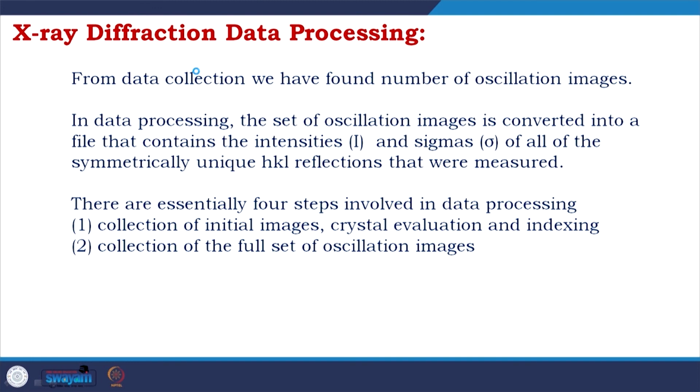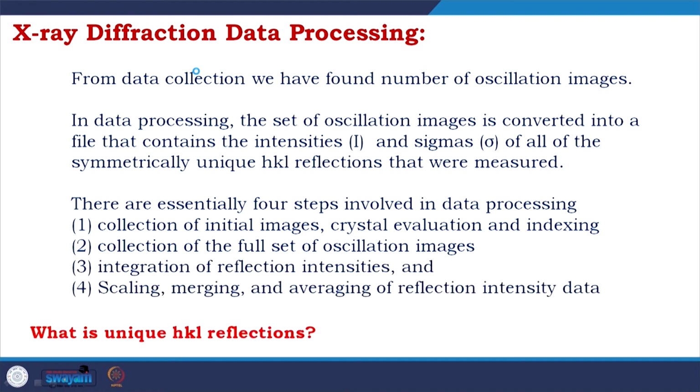Collection of a full set of oscillation images, integration of reflection intensities, and scaling, merging and averaging of reflection intensity data. We talked about what is unique hkl reflection. We will talk about what is intensity and sigma. And then we will proceed with the solution.